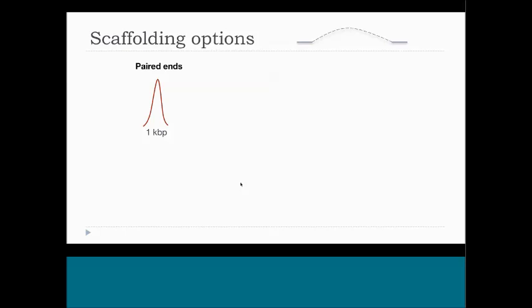And so what are the available options once we have contigs from PacBio sequencing to stitch them back together into longer scaffolds? The scaffolding problem has been around since the days of Sanger sequencing, and I'm showing here a little cartoon on the top right. Usually it comes as a pair of reads linked together based on some physical evidence. In the old days, you would have some, say, BAC clone where you have a size estimate, so you know those two ends should be separated by some size.